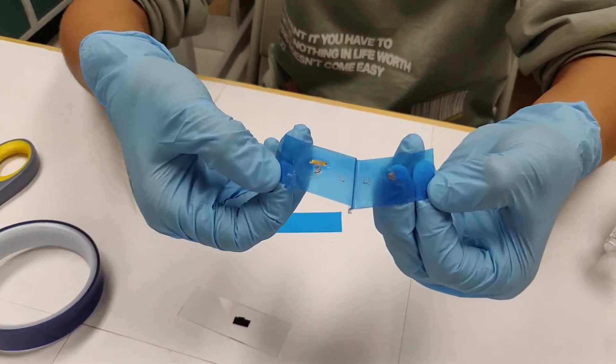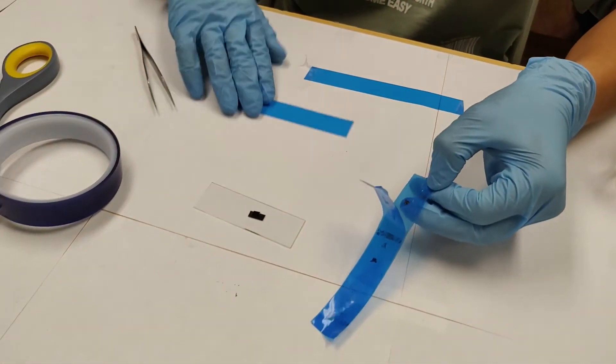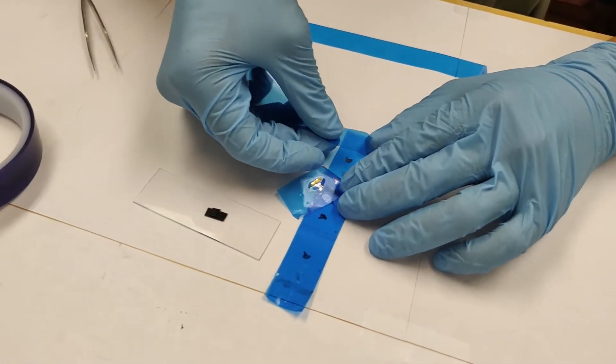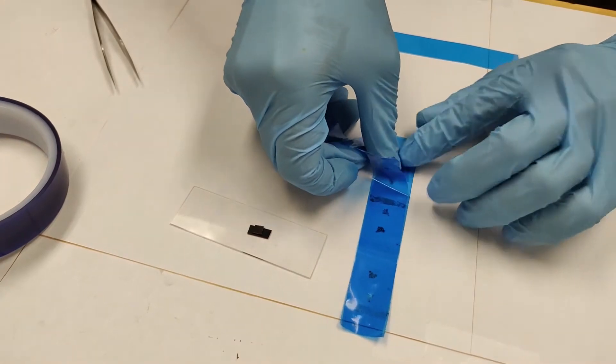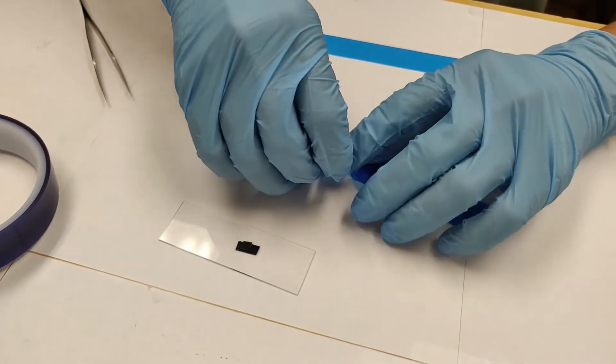So this is the bulk MOS2 right here. And what you want to do is get a piece of tape and place it over the bulk material. Then just lift it off.